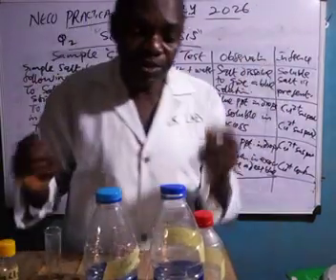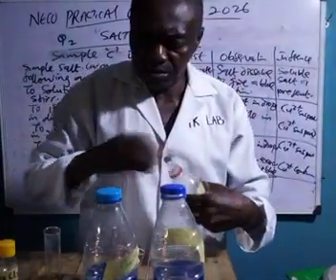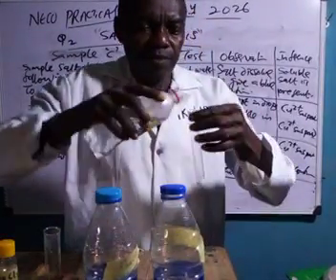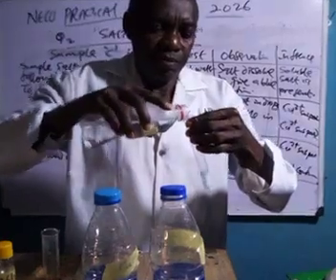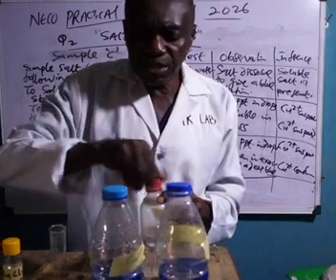Where is our HCl? This is our HCl. It did not dissolve, it's still there. Insoluble in dilute HCl.